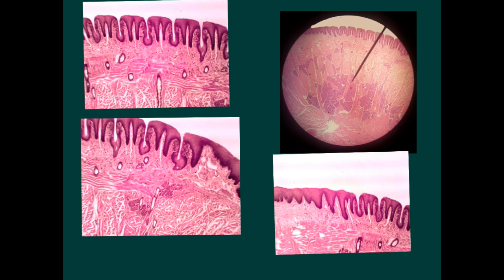The most important thing, this tongue of rabbit appears as a bulk of muscle and covered on one surface by this mucous membrane. And this mucous membrane, if you look carefully, shows at least in part of it these rectangles of papilla foliata, and each one has these two epithelial ridges alternating with the papillae of connective tissue, looking like the figure of the number 11. And here we have the muscle in different directions.